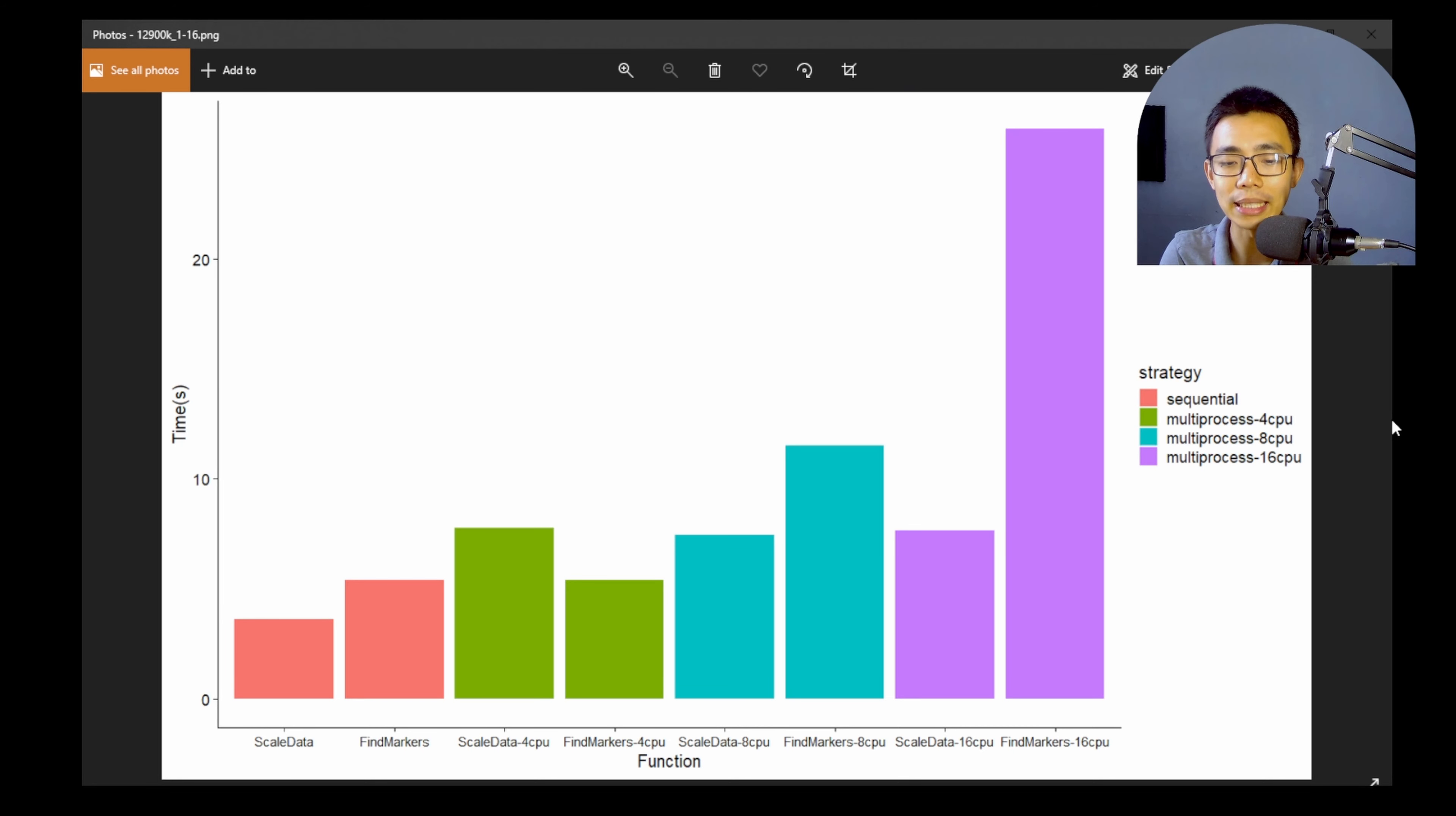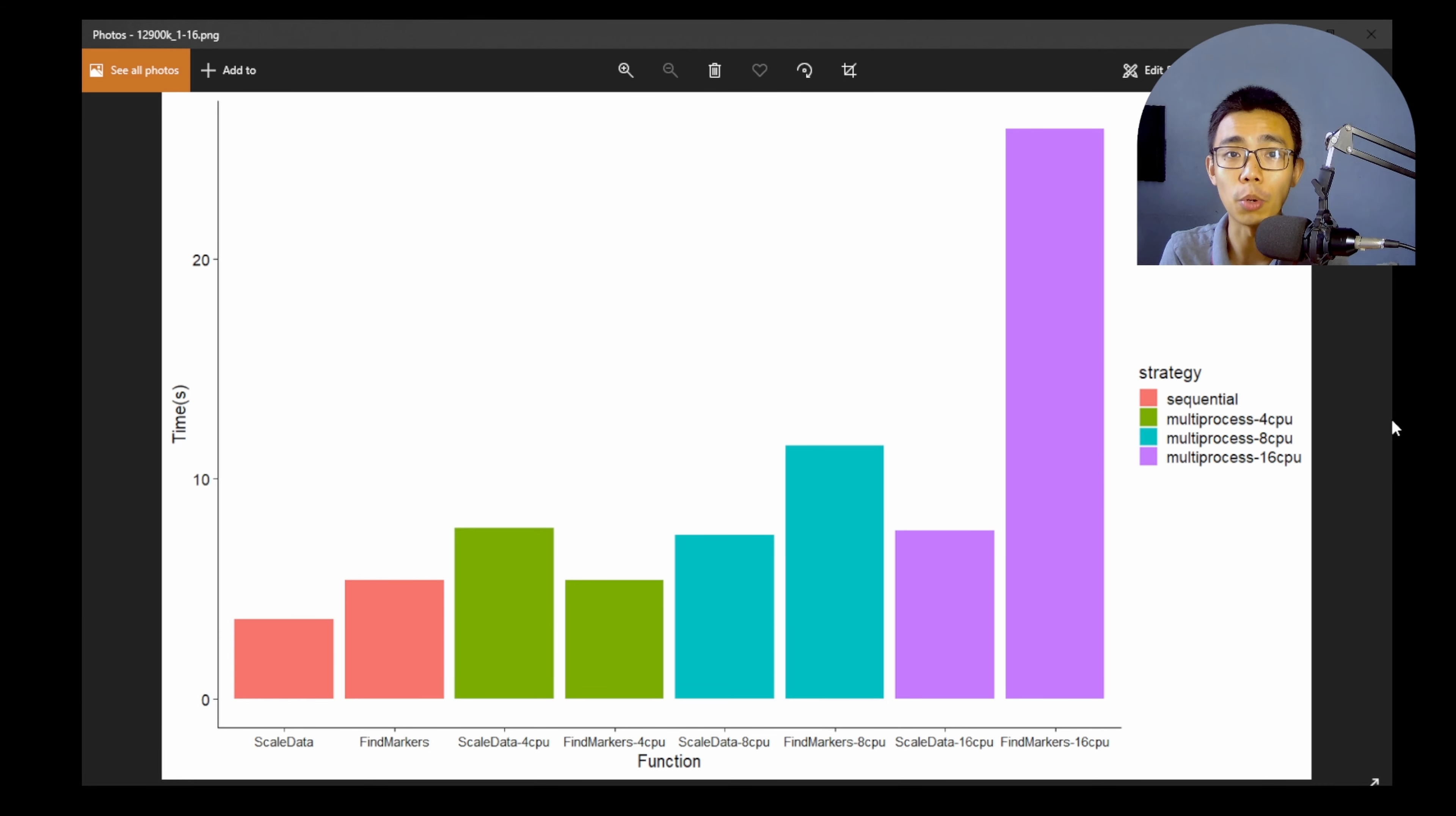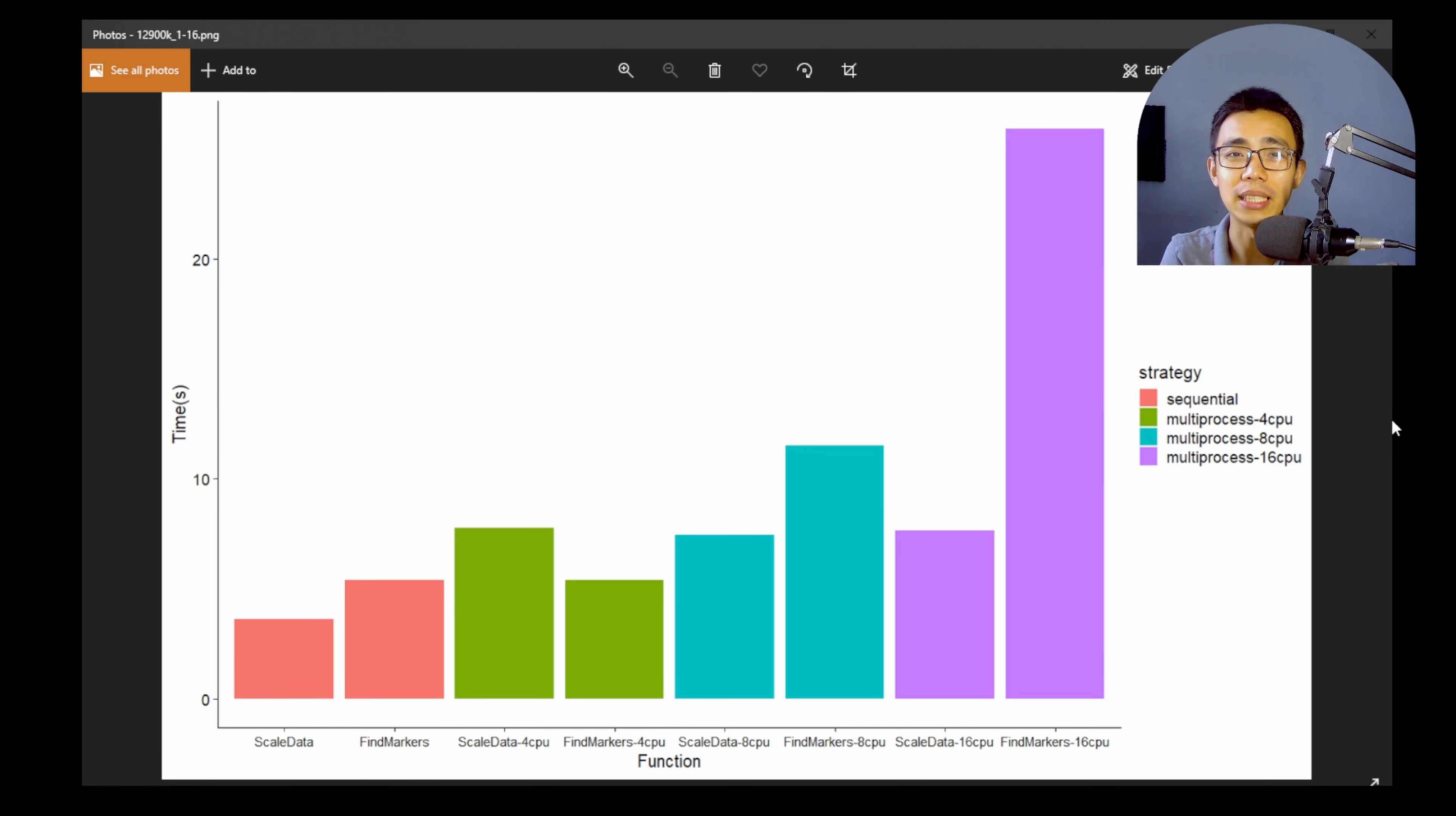So what does this tell us? First of all, parallelization doesn't always make things faster. It might make things slower. And it's important that you are going to run this thing, first of all, on your own computer and see what happens, because it will depend on the CPU type, the threads that you have and the cores you have, whether the new models that you have, and there's a lot of factors that could affect the situation right here.